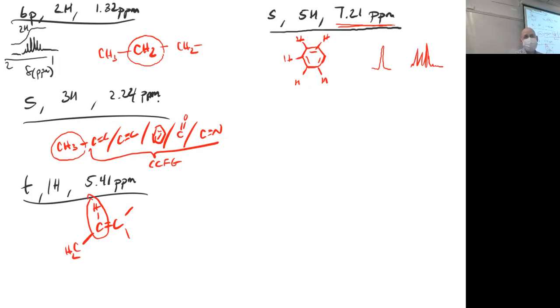So if it wasn't a singlet, let's say it was a triplet or something, would it be a CH2 on the extra? Nope, it would have to be hydrogens directly attached to the benzene ring. And so really the splitting that you see doesn't matter whatsoever. It is 5 hydrogens on the benzene ring, and that's all you need to know, because there's no other way to draw a benzene ring with 5 hydrogens. You could spin it around and have the blank spot be at the top or the left, but it's all spinnable.